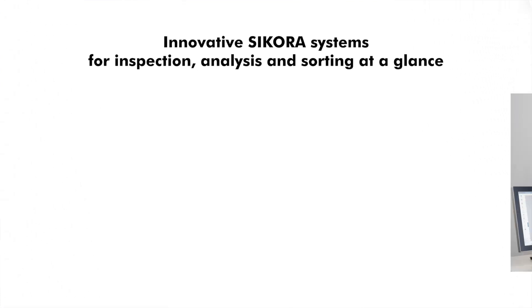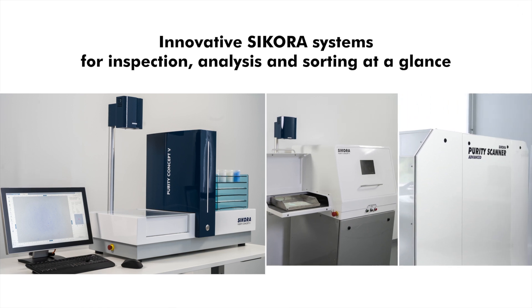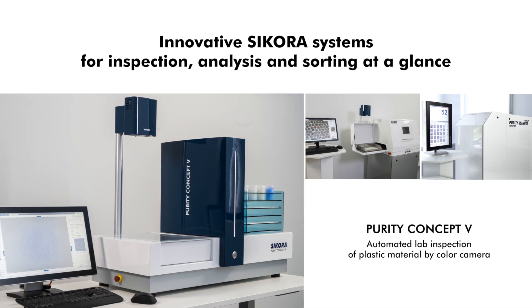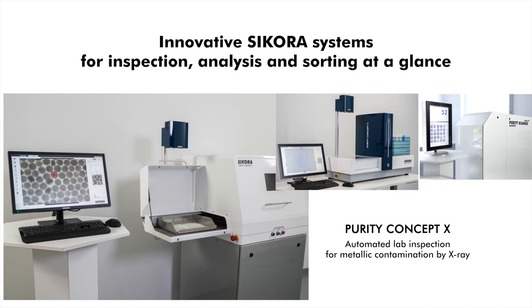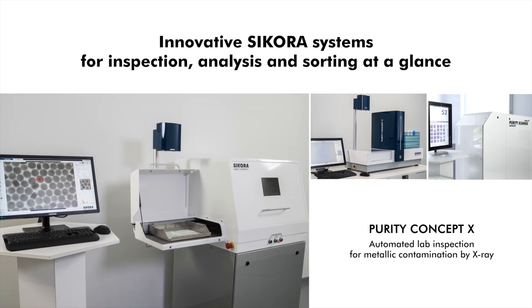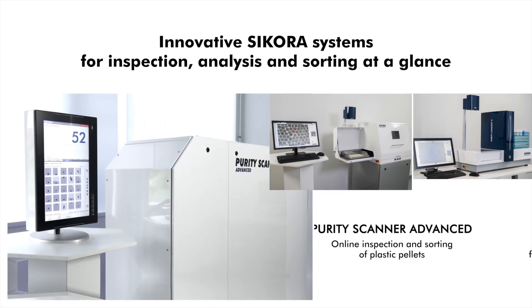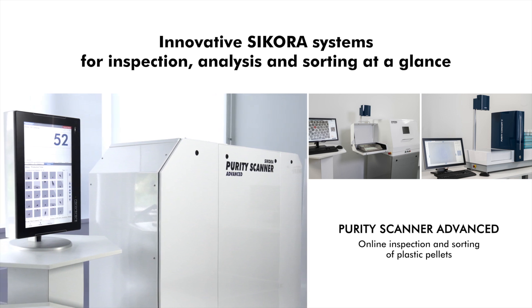Innovative Sikora systems for inspection, analysis and sorting at a glance: the Purity Concept V for automated lab inspection of plastic material by colour camera; the Purity Concept X for automated lab inspection for metallic contamination by X-ray; and the Purity Scanner Advanced for online inspection and sorting of plastic pellets.